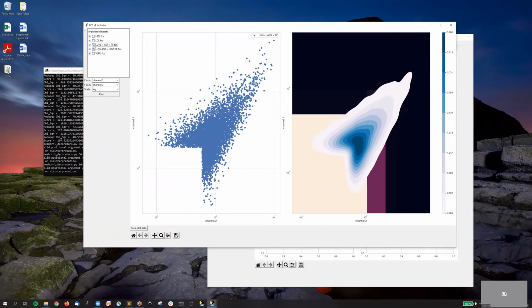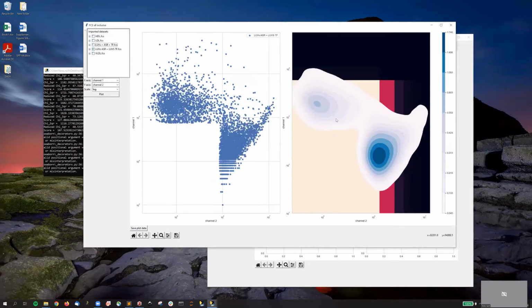And then if you go to the other one, it will be like this. Yeah. So pretty much these two populations of this density plot correspond to two types of liposomes that are loaded either with one dye or with another.